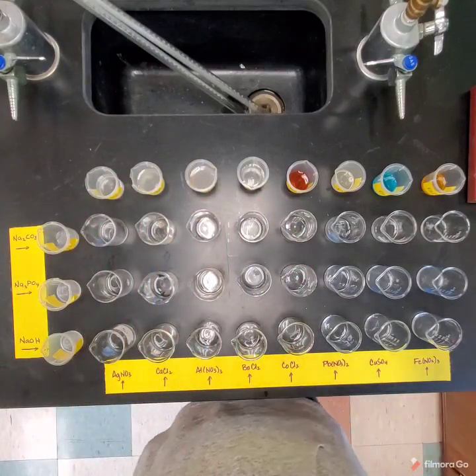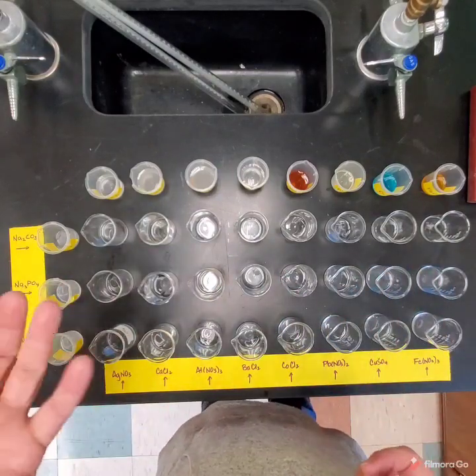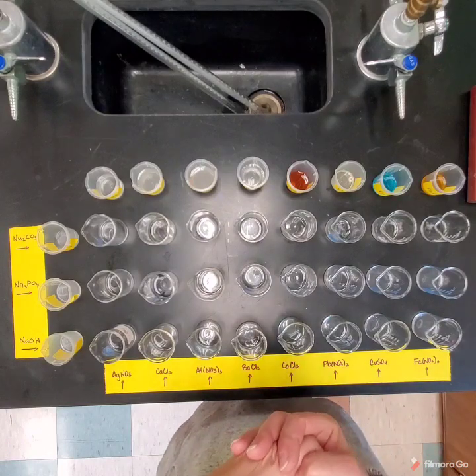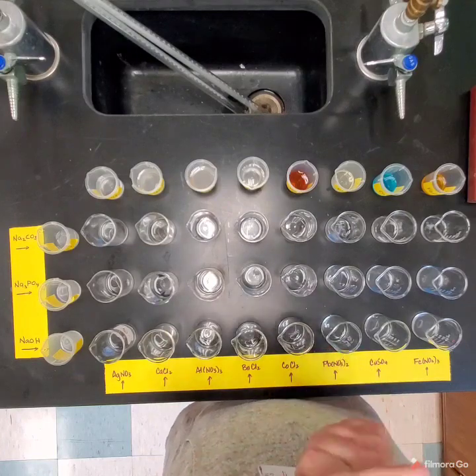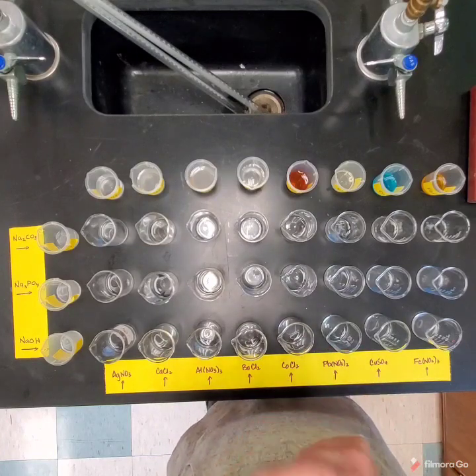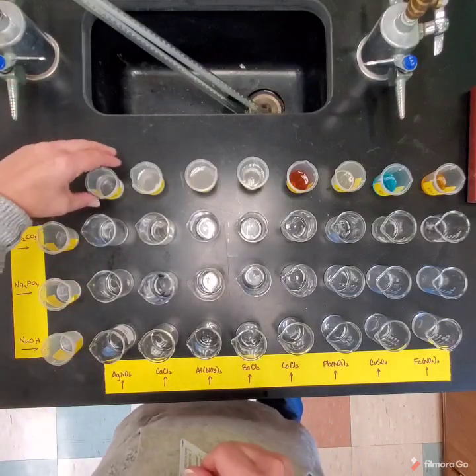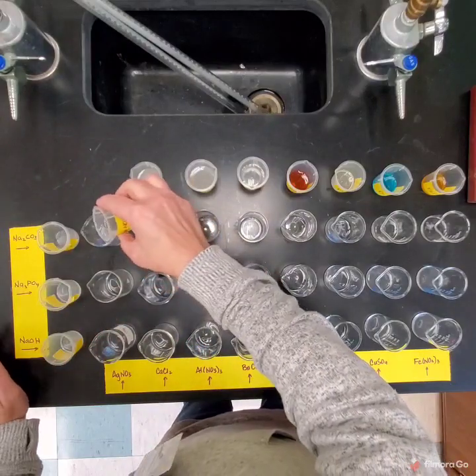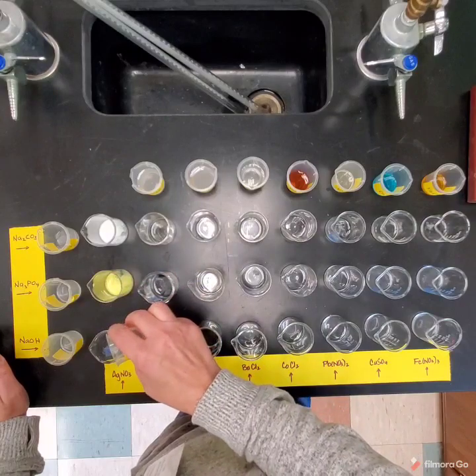So what you're going to do is watch, I'm going to mix them together and add them. Then I will hold up each individual beaker. You're going to need to write your observations down, and then you're also going to need to name the substance that's formed and write the formula for the substance that's formed. Okay, so this first column here is going to be silver nitrate. I'm going to add a little bit in here, and you should see immediately what happens.